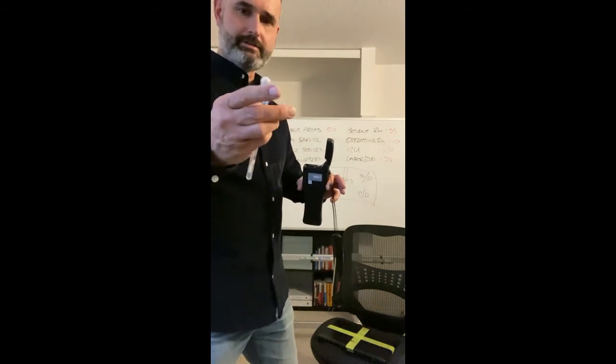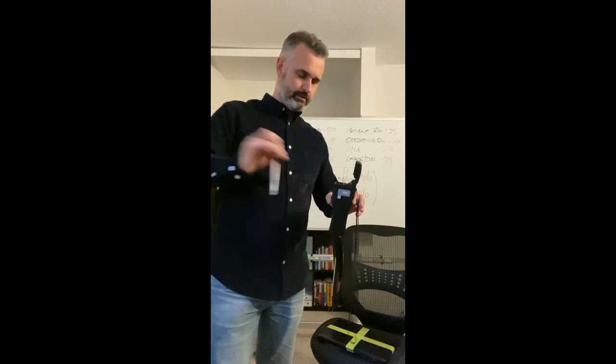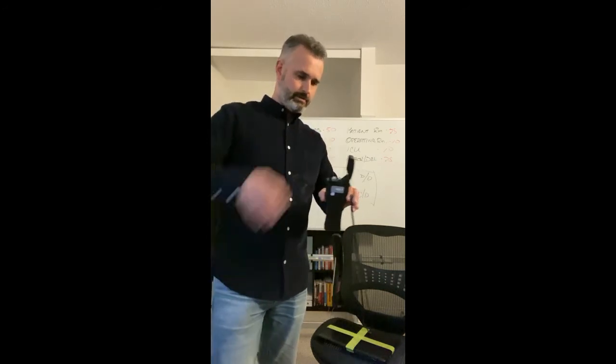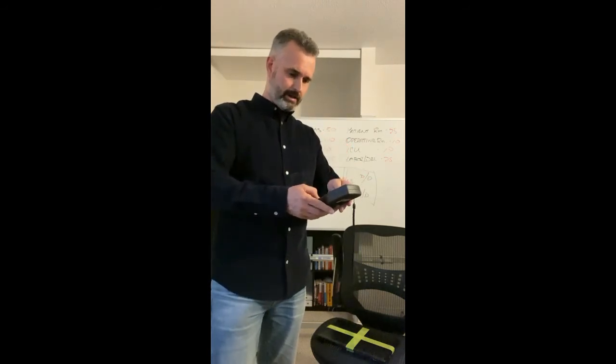All right, give that a snap. So if you want to look up exactly how these ATP meters work, just go ahead and Google ATP meters, and they are commonly used for the food industry, hospitals, that sort of thing. They're not the only means of testing, but they are a reliable and consistent means of testing.